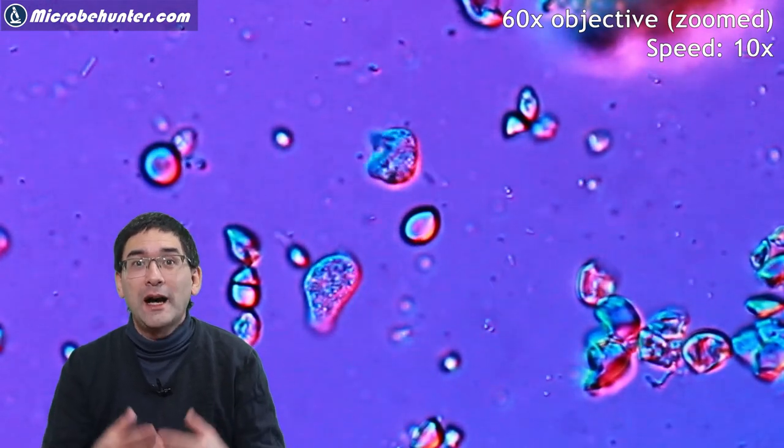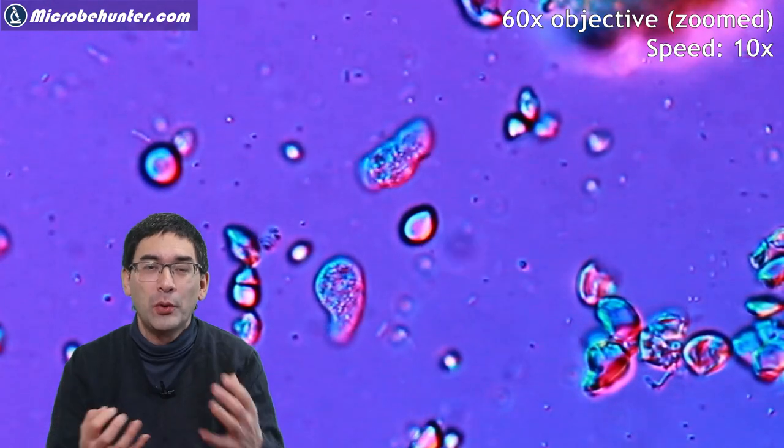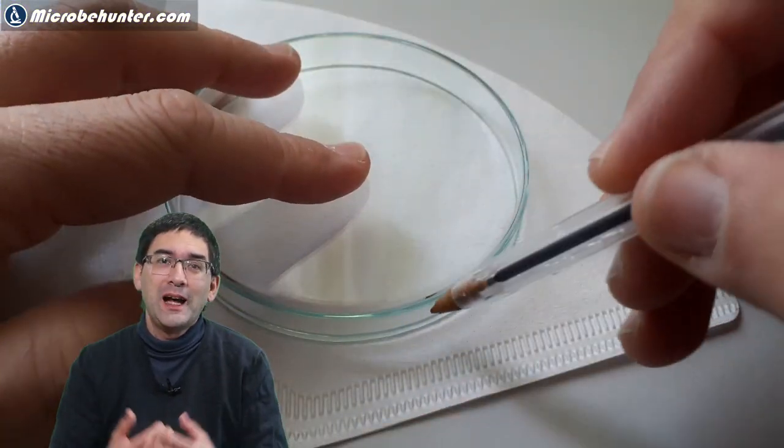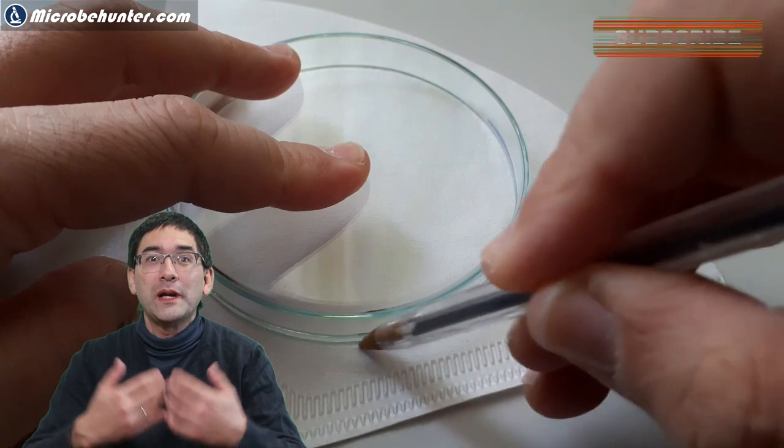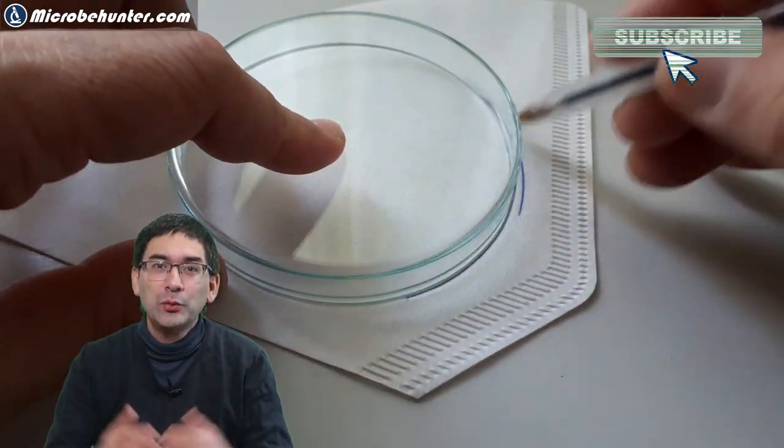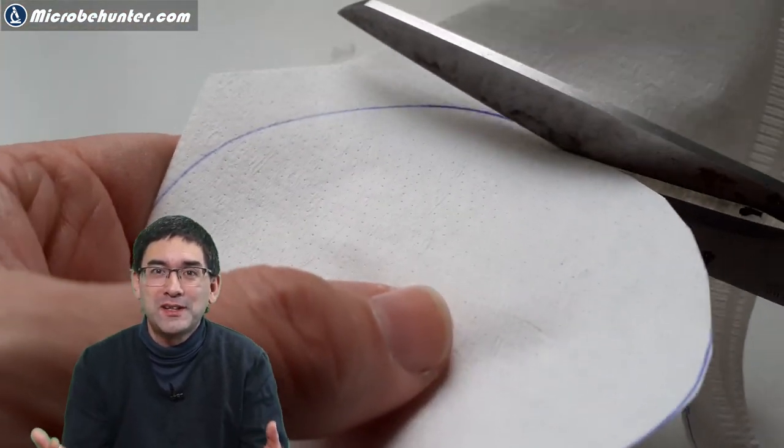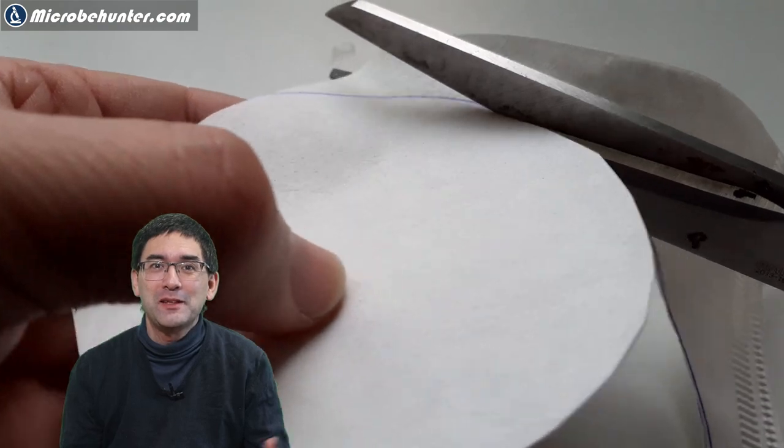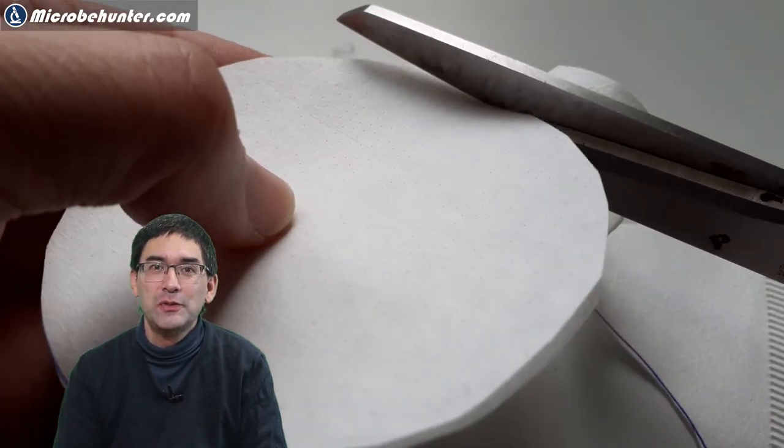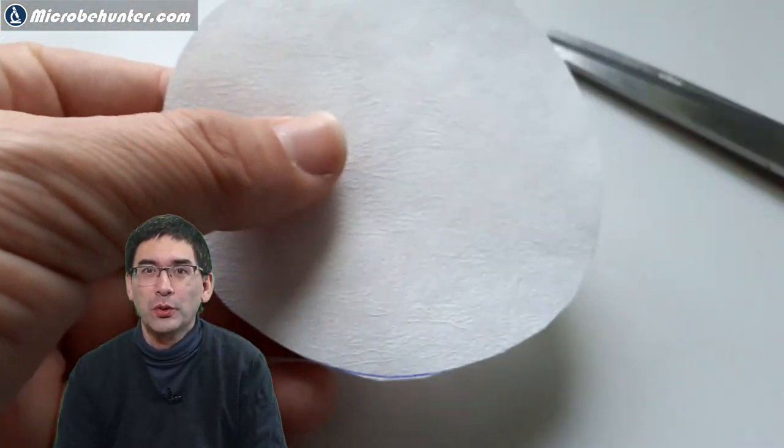How do you do that? Well, we have to provide a little bit of food to the decomposing and rotting wood, and then we can hope that we're able to multiply those amoeba that are already present. I've used a coffee filter and simply cut it out. In this case, I'm using two filters, but I think tissue paper should also work fine.